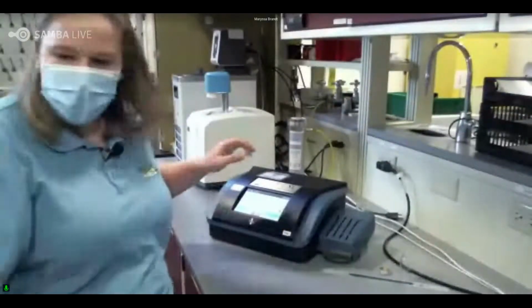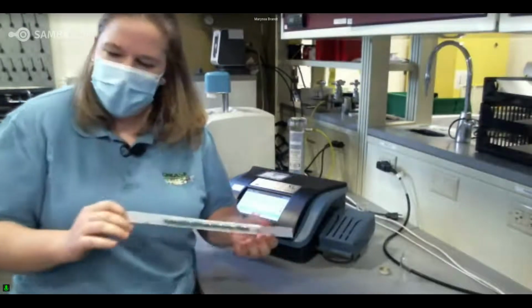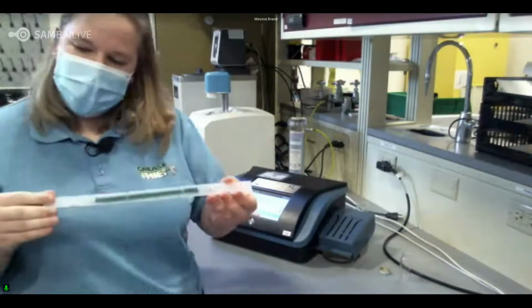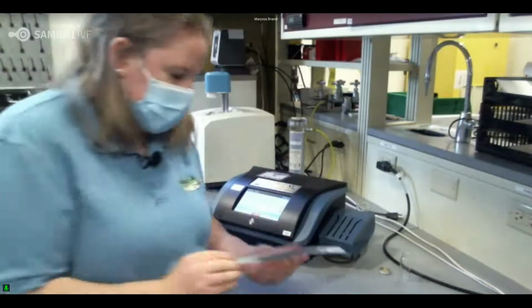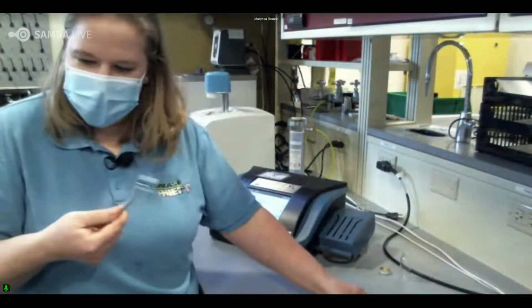So here behind me, we have the Vapor Pro. In a previous Grease Thief Thursday, we saw we extruded a grease on a substrate via ASTM 7918. And so that is right here. So as soon as a grease is extruded here at MRG Labs, what we'll do is we will take one of these substrates off. Easy enough.